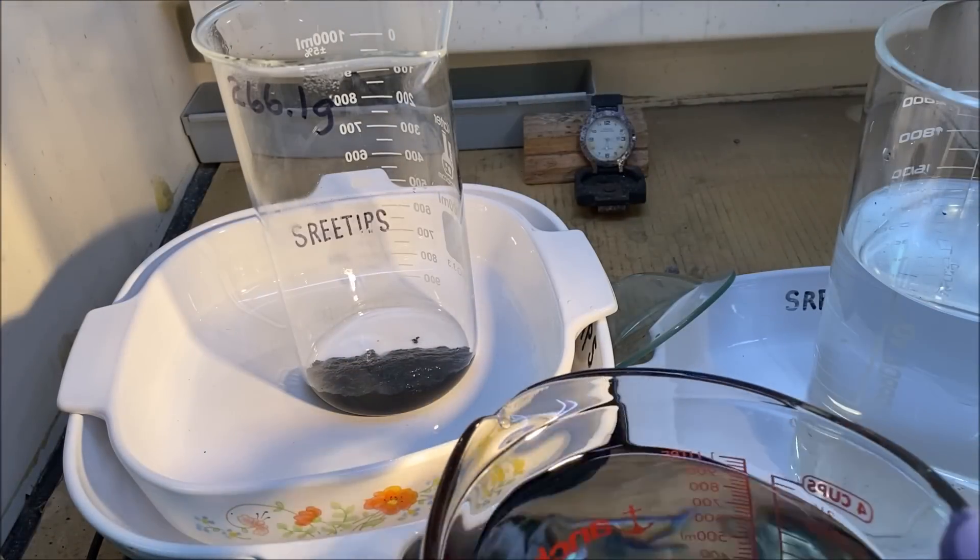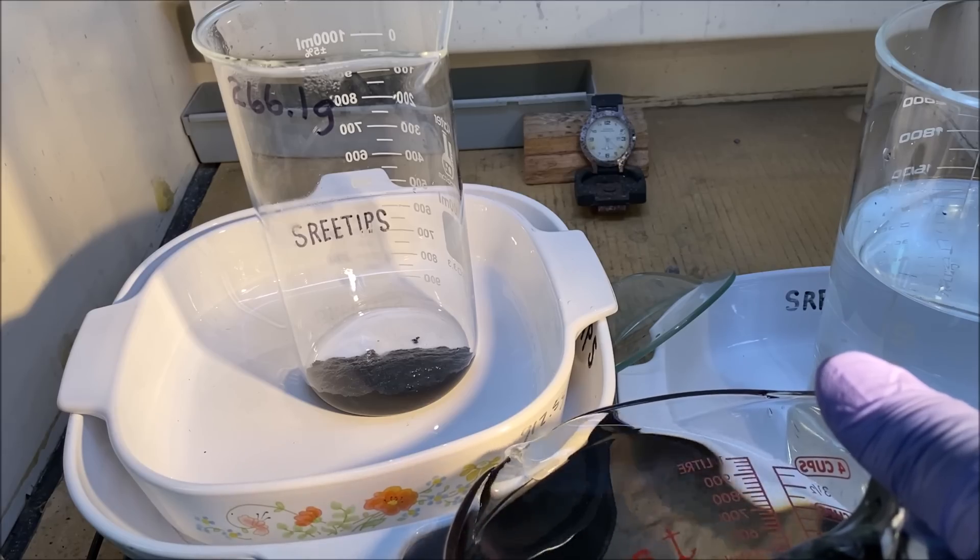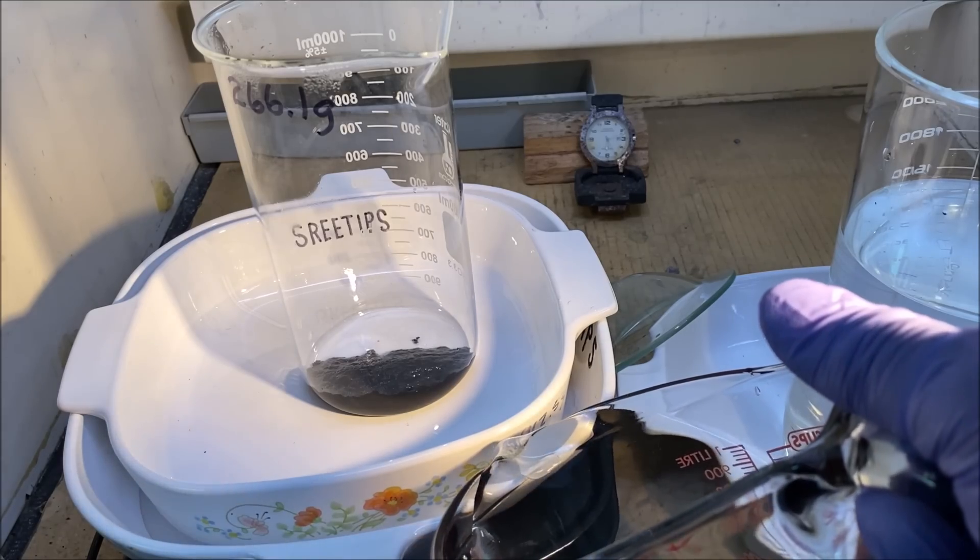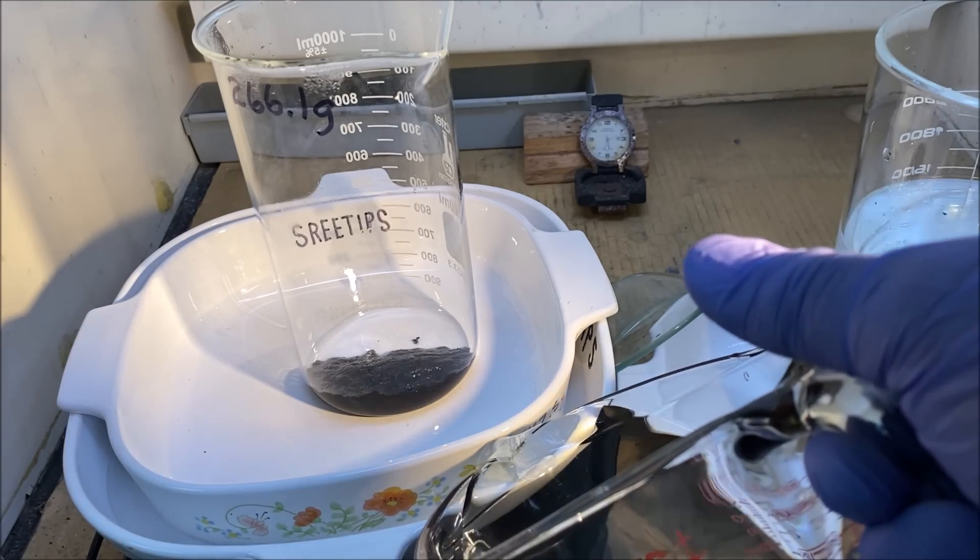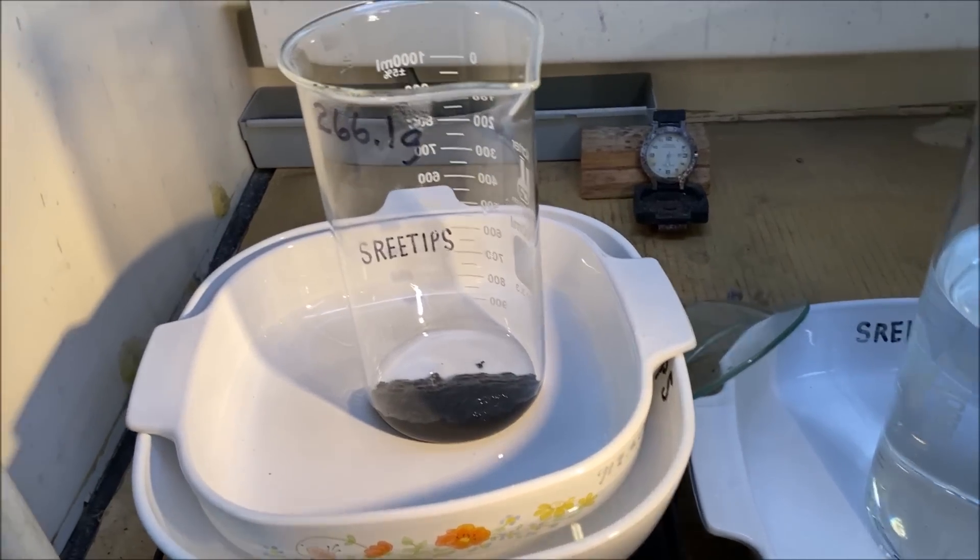Now we're going to fill up our container with some water. Add some heat to it and use a water bath to dry the black PGM powders.